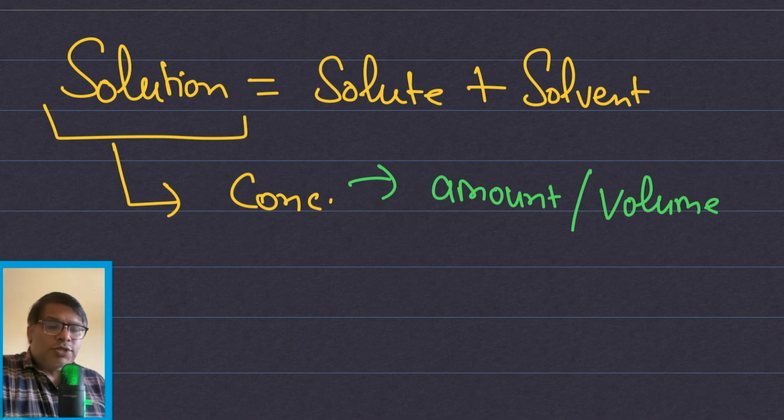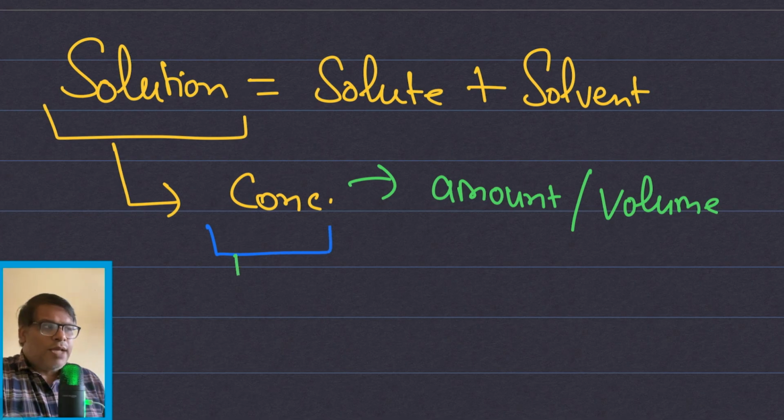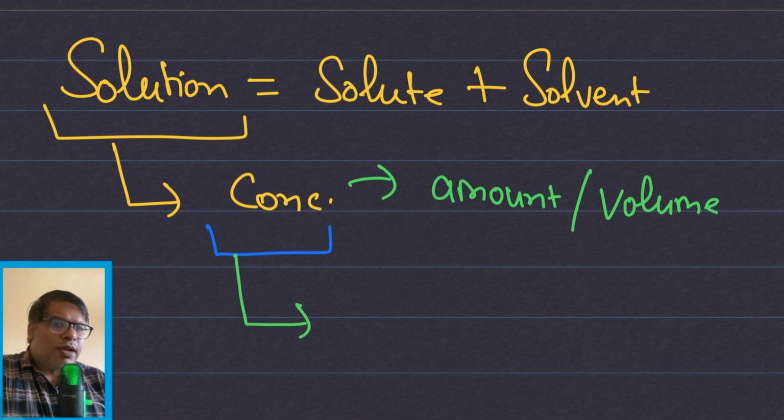Sometimes in the laboratory you are going to prepare a concentrated stock solution. It is not an easy task to prepare any chemical solution, and you want to devote most of your time to experiments, not to the preparation of solutions.